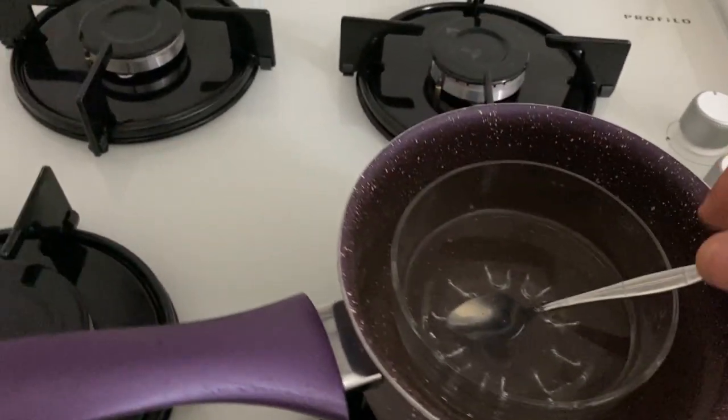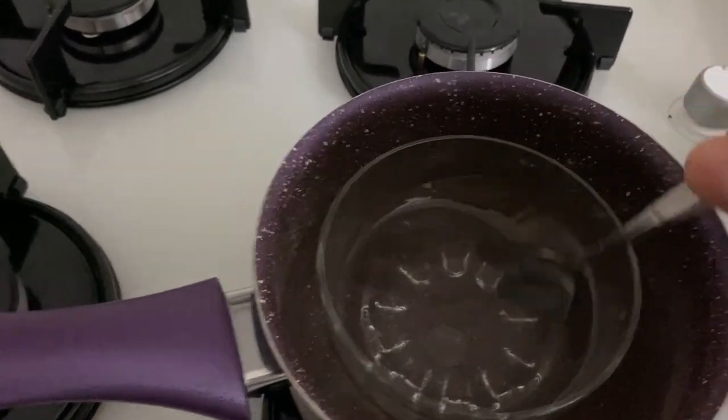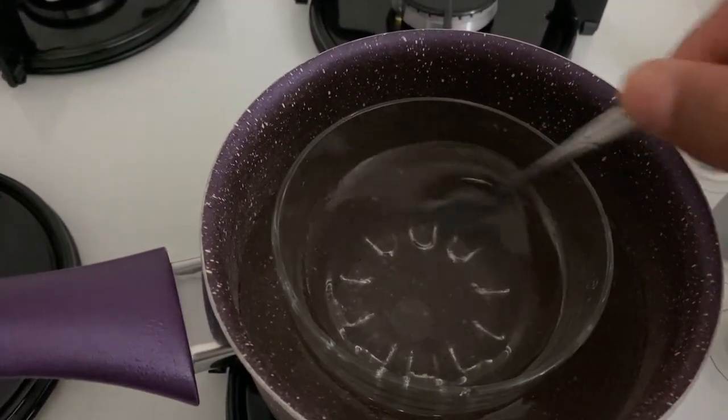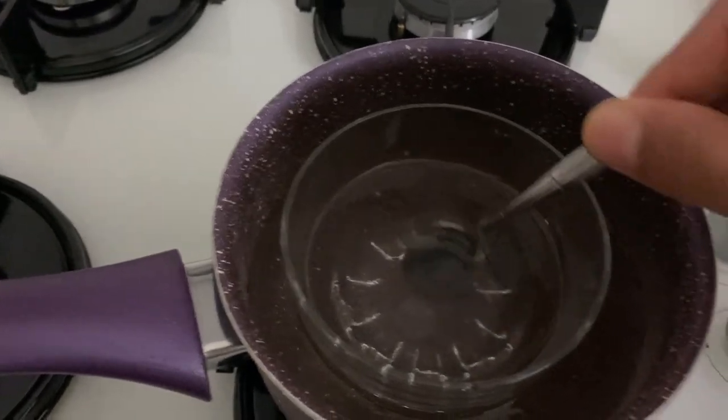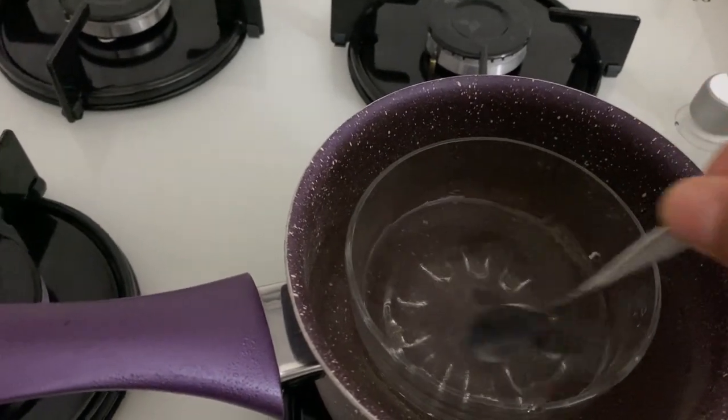Now it's better to heat it a little bit in a hot water bath to help it dissolve better. For about 5 or 10 minutes, if you heat it in hot water it will be better — you will get a better result.